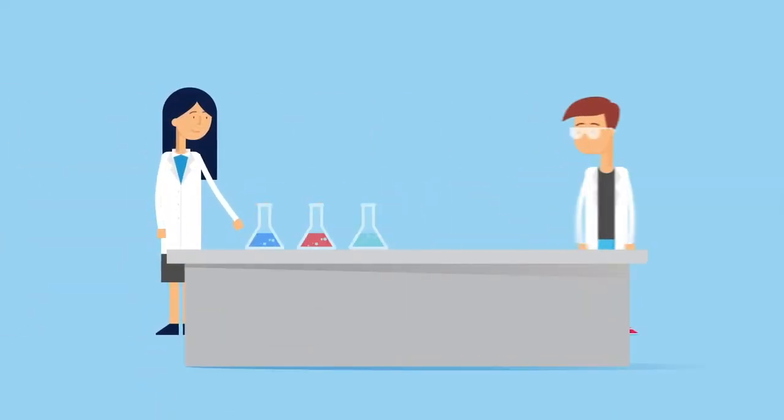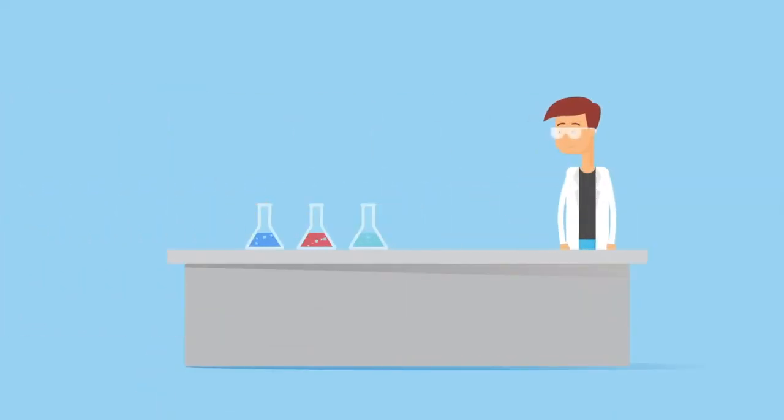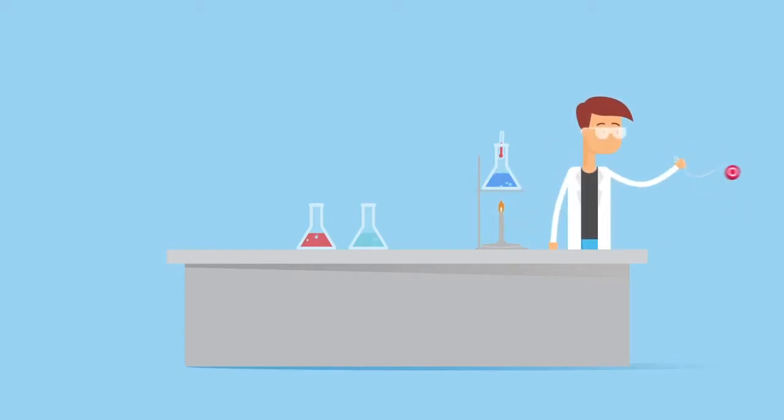Today, Linda has entrusted Lenny with preparing samples for one of Paddy the Postdoc's experiments. Lenny knows these samples are temperature sensitive and the amount of sample is limited. While not the most advanced piece of lab equipment, Lenny is confident in the heating ability of his trusted Bunsen burner. As long as Lenny pays close attention to what he's doing, the samples should be fine.